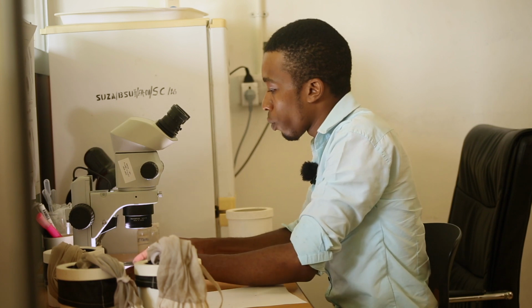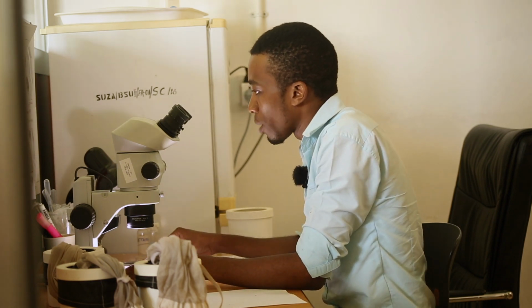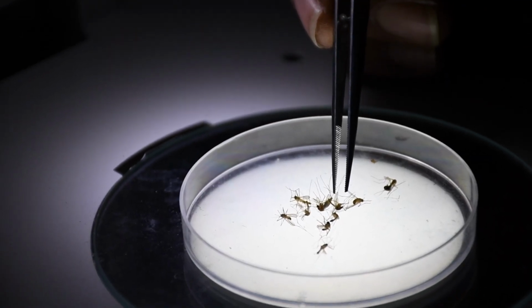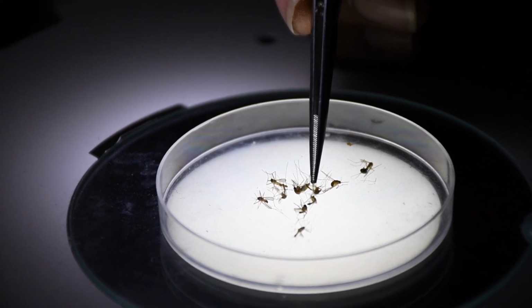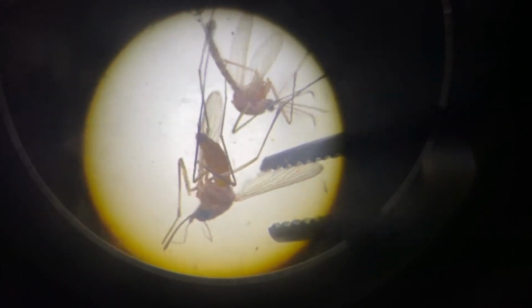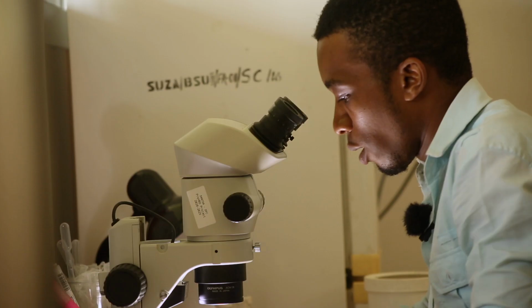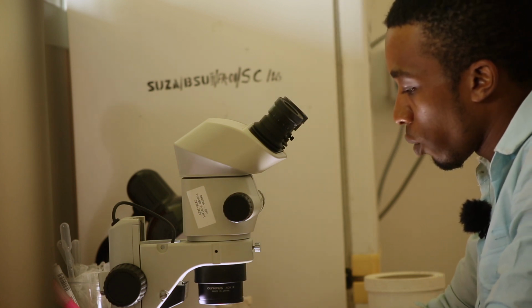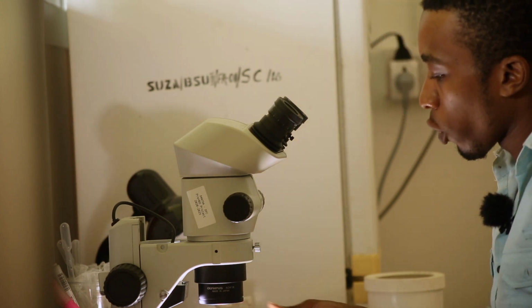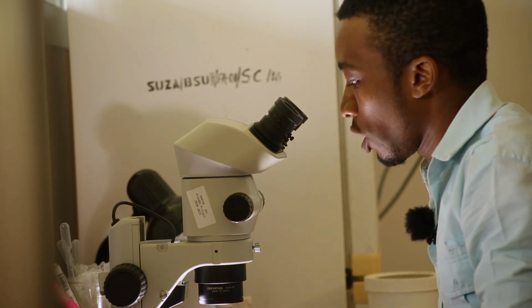We use the microscope to identify any features that will pinpoint the exact species of this mosquito. I have a female, a female. So we've separated the Culex species into male and female mosquitoes, and so we can store them accordingly based on the species type and their gender.